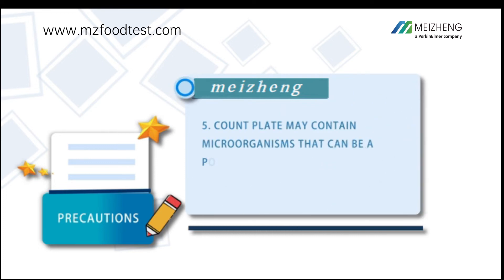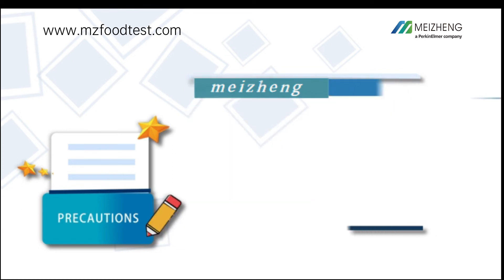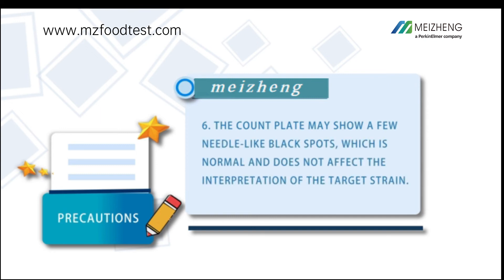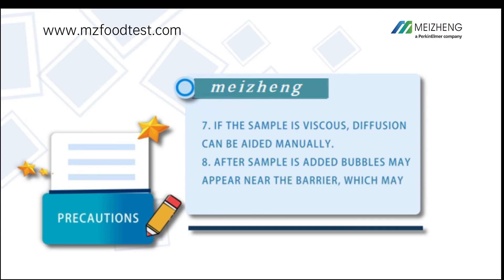Count plates may contain microorganisms that can be a potential biohazard. Please follow relevant laws and regulations for disposal. The count plate may show a few needle-like black spots, which is normal and does not affect the interpretation of the target strain. If the sample is viscous, diffusion can be aided manually after the sample is added.